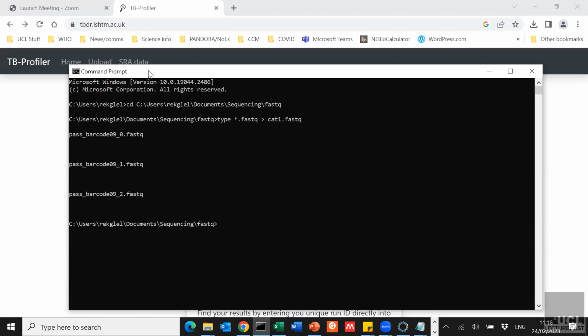They really do keep up on it, I think. So are you able to then download the message that you went through to the profile? That is the advantage of doing it by line command. I don't think you can download it on this, but if you do it by line command, you can see an output.